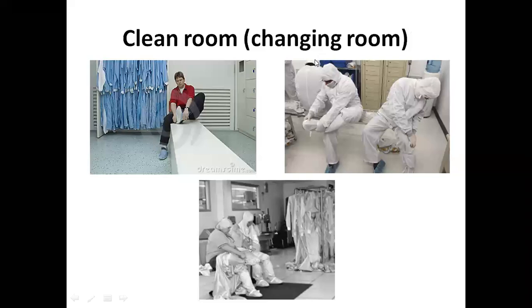Clean room, changing room. So initially, when you want to enter the clean room, first you have to change the dress. You have to put the coverall, and you should put the proper clothing. Otherwise, you would not be allowed inside the clean room.